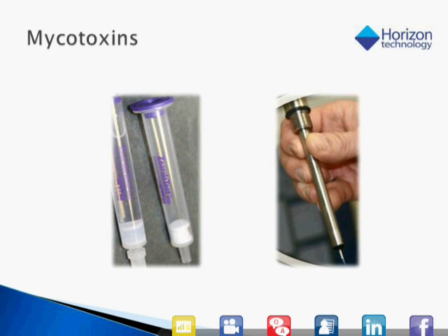So this cartridge comes with a cap, top and bottom, and the assembly on the right shows a plunger assembly that has a needle at the bottom. So the needle will pierce the top of that cap, not allow that buffer to drain out, but more importantly, it does not drive the plunger down into that gel, which is very soft and would be crushed and would not be allowing that cartridge to be used for the application. So this process can be automated for those who have an interest.